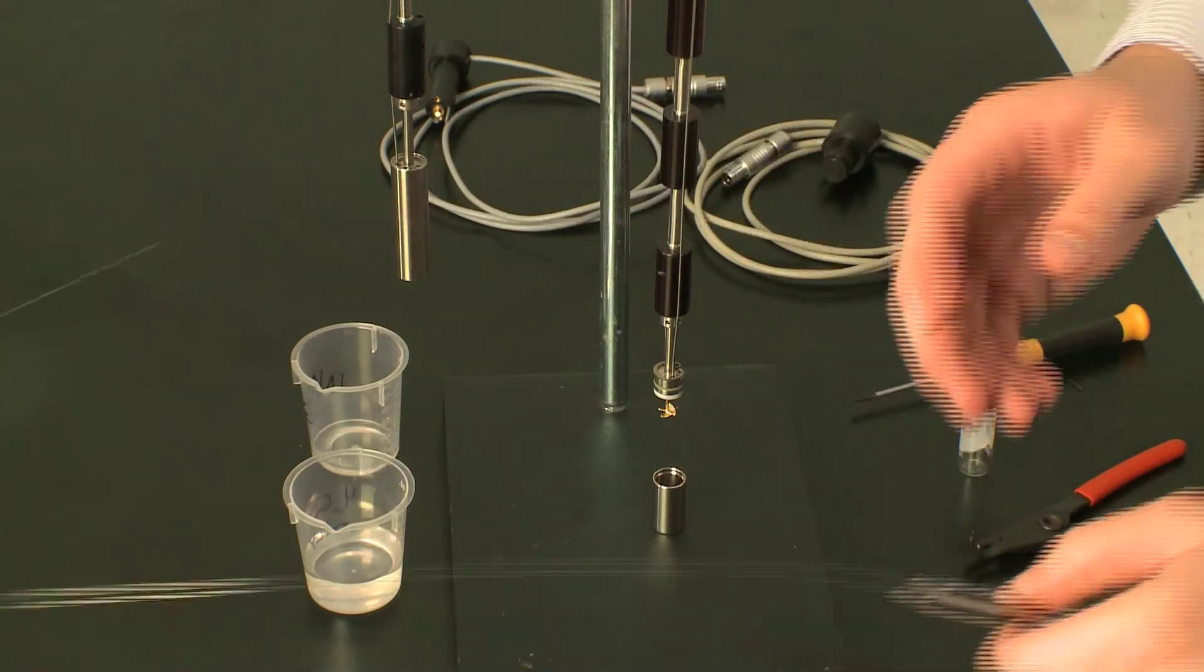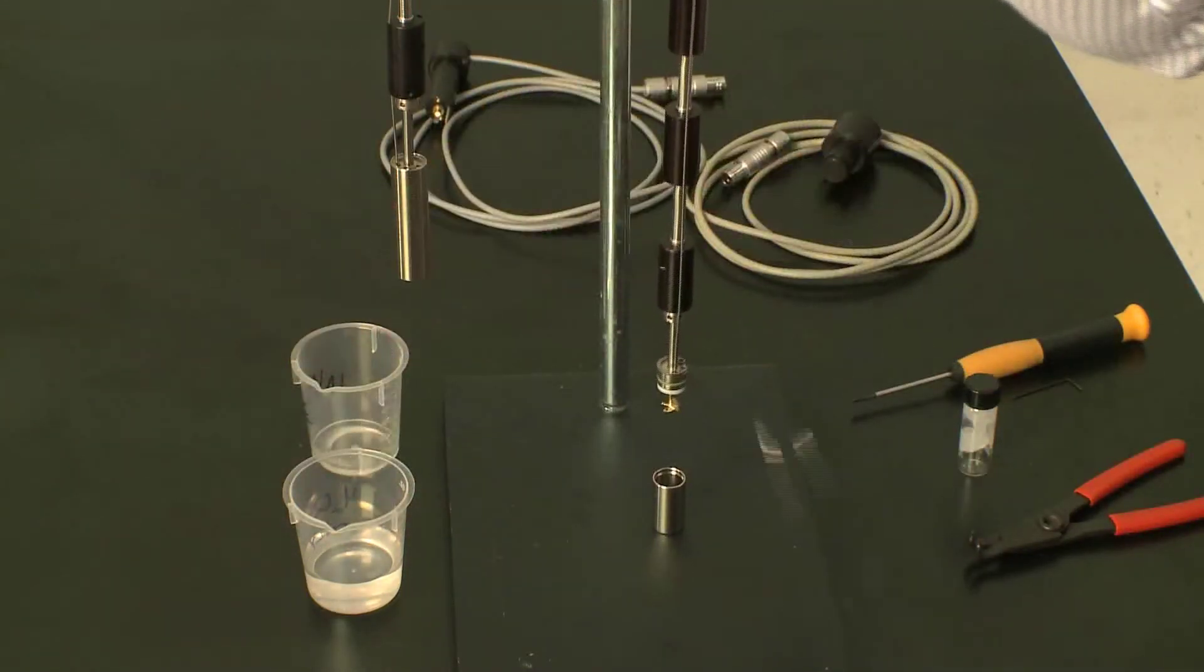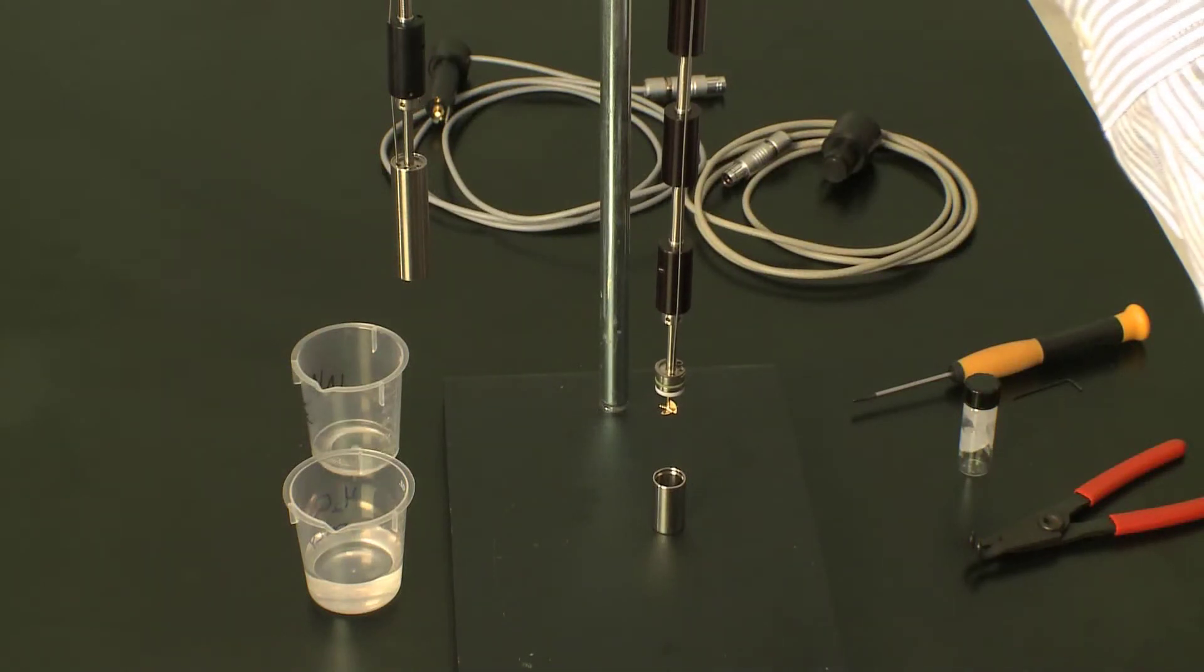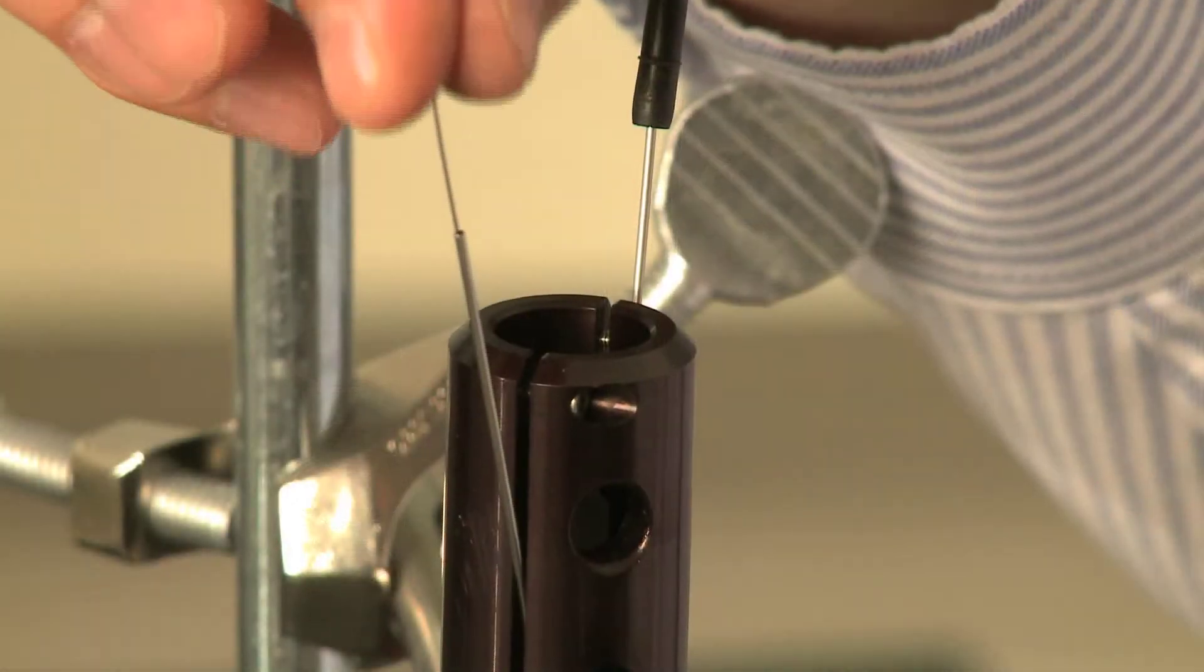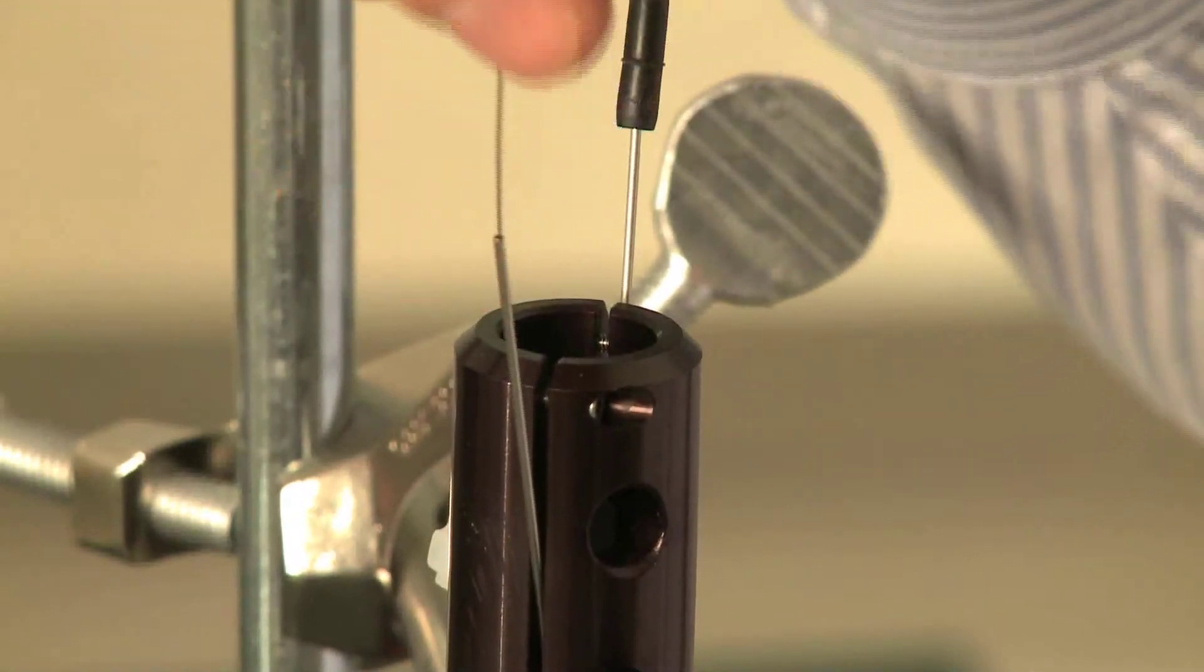Next you need to adjust the height of the syringe cannula with respect to the stirrer itself. Now that I have my stirrer in place, I can place the syringe cannula down the guide tube.